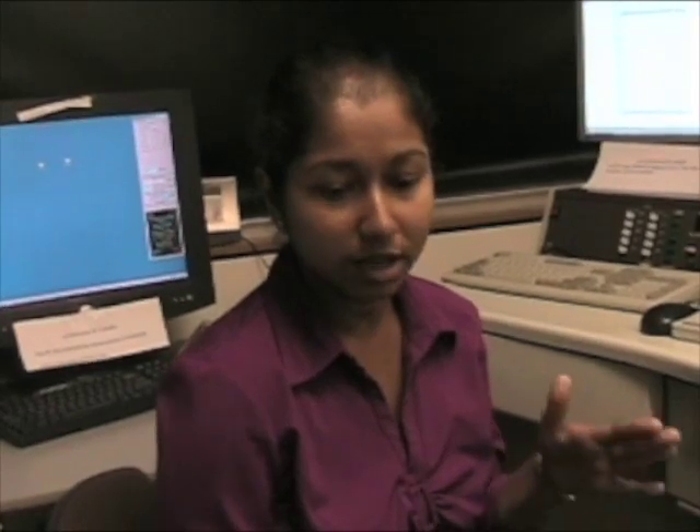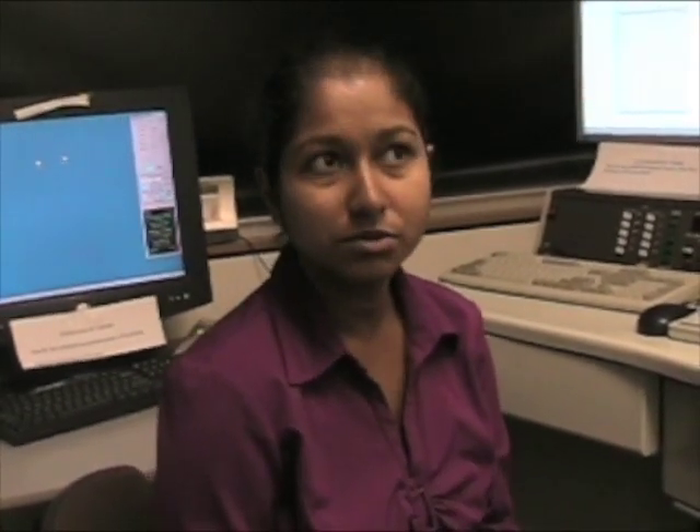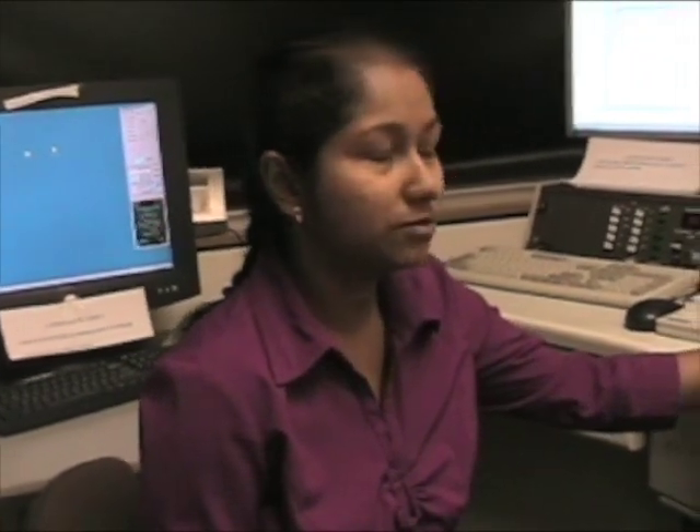What type of nanoparticles are they? I have some cadmium sulfide and some manganese oxide with me today. You can check pretty much everything. TEM can go a little higher in magnification compared to SEM. So with this TEM we can pretty much check anything from 5 nanometers to 100 nanometers or even more.